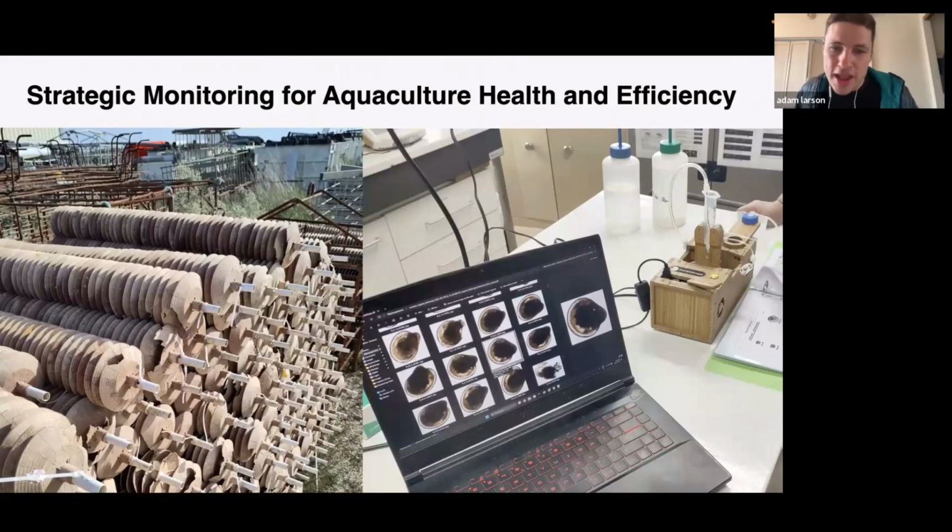And then again, for free, as you're imaging this water, you could also see if something bad was happening. So if you had a bloom of Alexandrium or something that was going to cause a harmful algal bloom, you'd be able to see that in your data, and you could very easily train an object detector to tell you, okay, we have all these different larval stages, which is very nice, but we also have this bloom of Alexandrium. So maybe we should think about when we should put these plates in, or maybe put these somewhere else. So in this way, through this plankton assemblage, we get a lot of information on the water quality, because plankton assemblages really accurately encode a wide range of signals, both environmental and human influence, that are in the water.